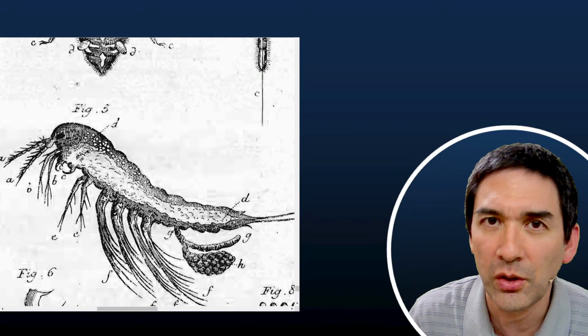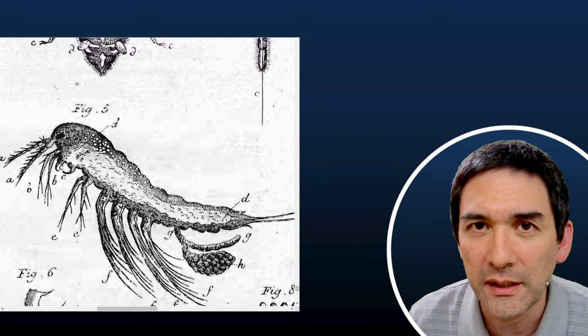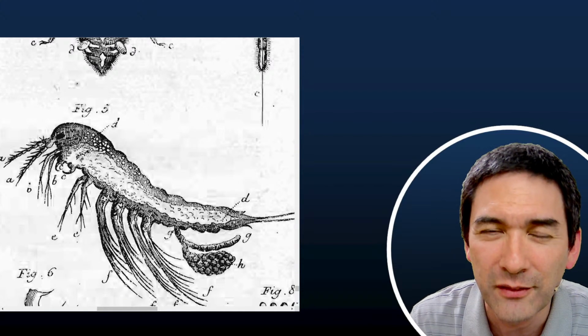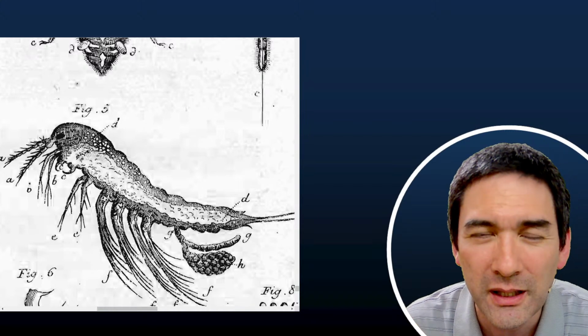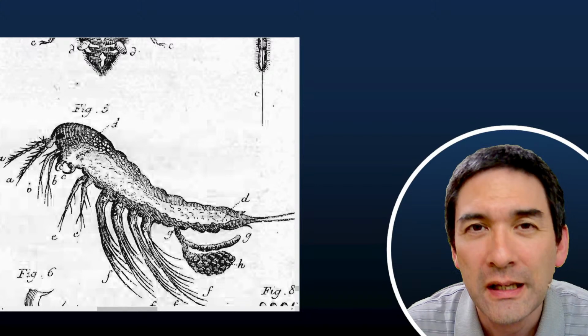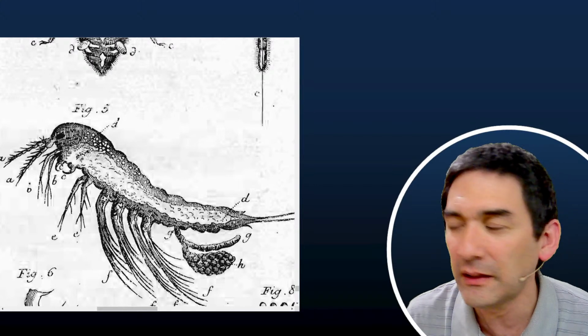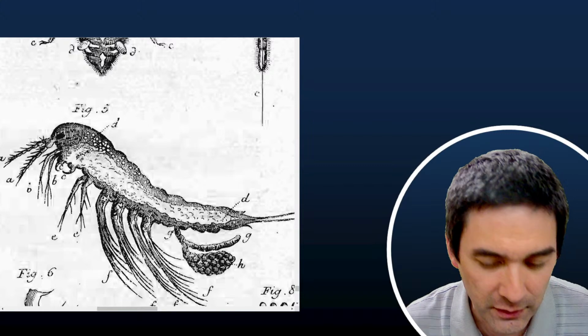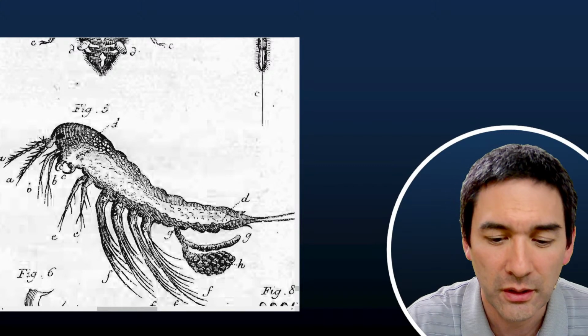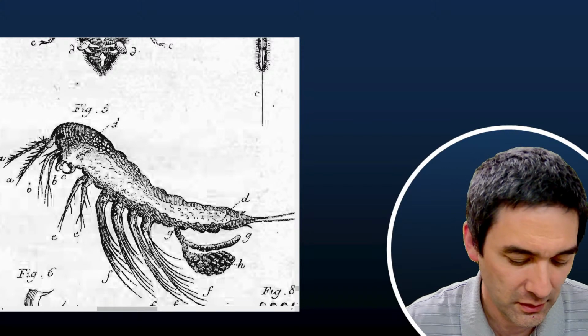And what I also found to work well is, sometimes it's not really dirt, but some kind of water spots, calcium carbonate. So a little bit of vinegar also helps because it dissolves the calcium carbonate. And if you want to really clean the slides, then I find it quite good if you use a dishwasher. Just let me show it to you. Look what I got here.